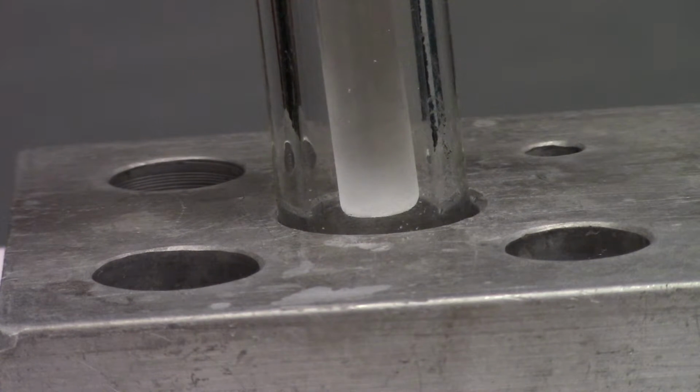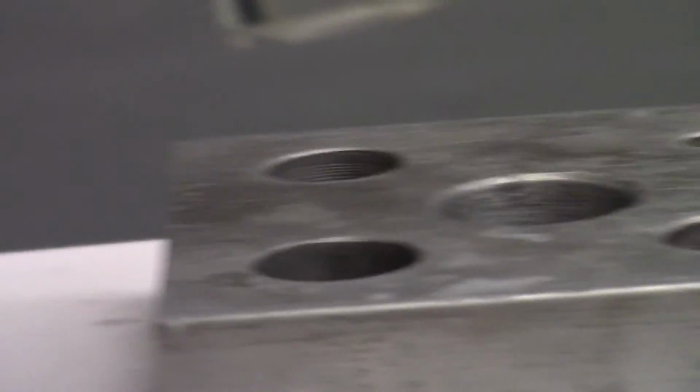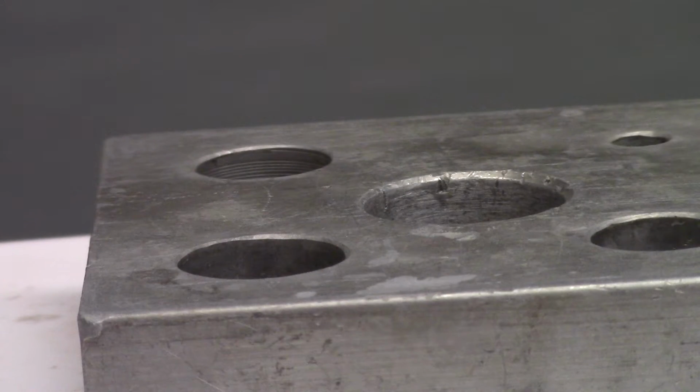Turn the heat off real quick. All right, now let me pull this out. Now I'm not sure if this is on camera. Let me just check. There we go. Oh, it's not too hot. Not too bad. The next trick is to get this stuff out without spilling the water. I'm going to pipette the water out of here as best I can.